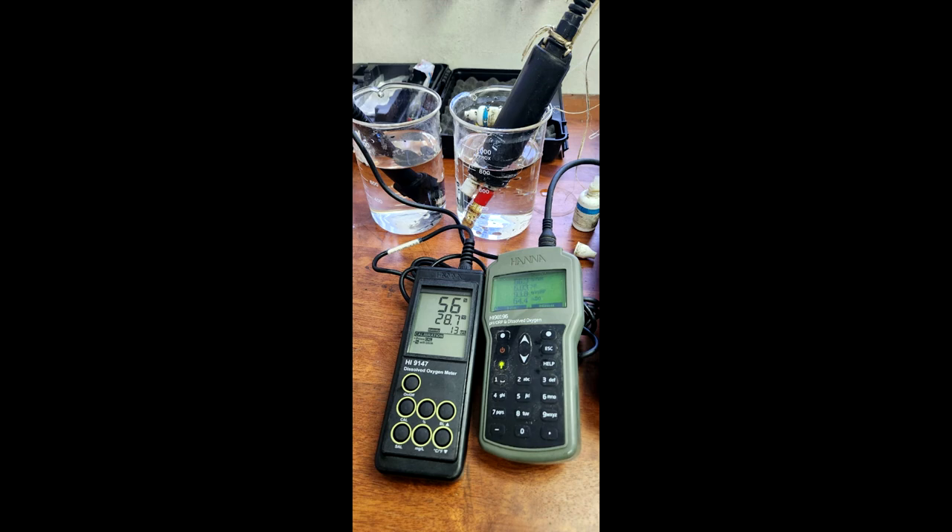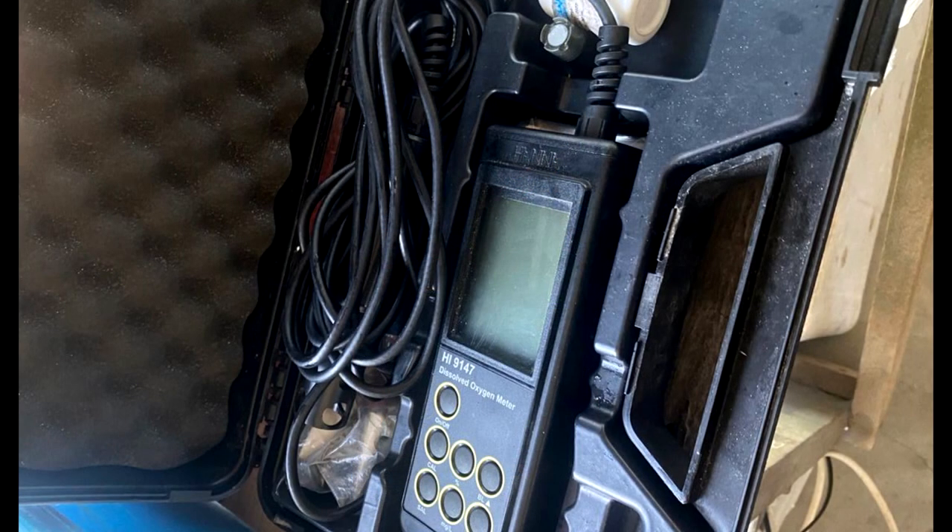Although the entry model — the one you see on the left — only measures DO and temperature, it even has a carrying case for you to put in all the probes and even the meter, which is a great deal. Because usually at our farms at night, we'll lock up everything and keep the meter in a safe closet to prevent anybody from taking it, since it's quite an expensive item.